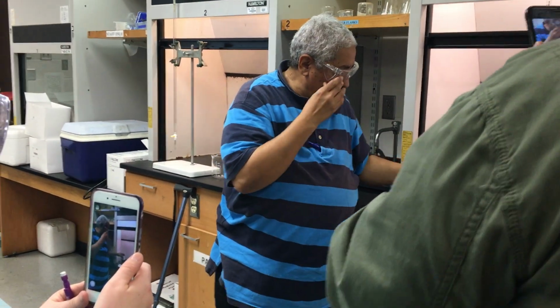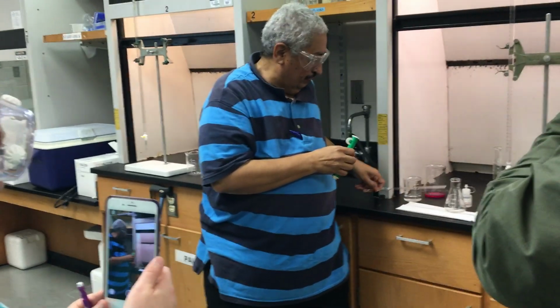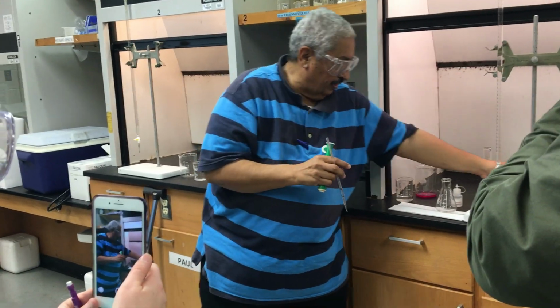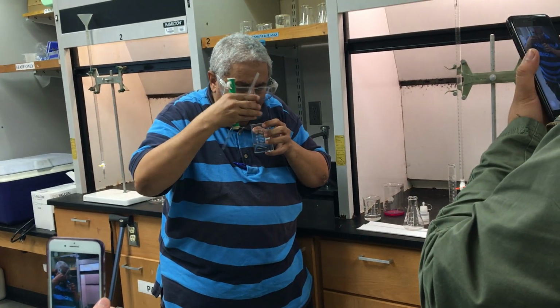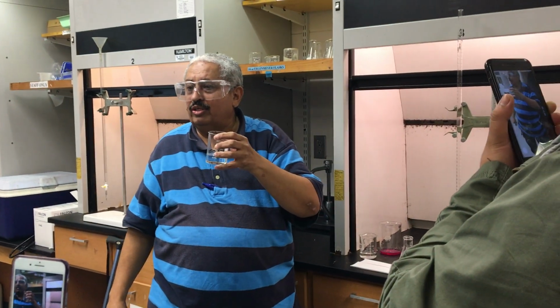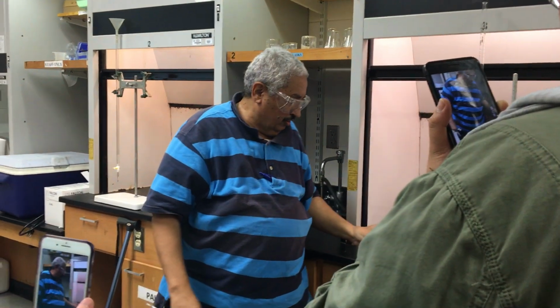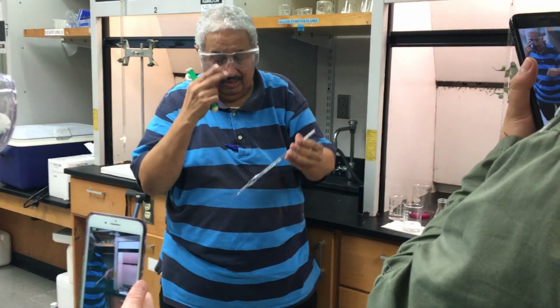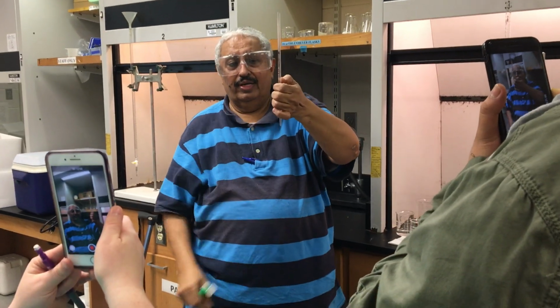3 drops, and now I have to pipette the vinegar here, which I think is vinegar. Waft a little bit, just to make sure that you don't mix the sodium hydroxide with the vinegar. It's really vinegar, you can smell it, verify it. So now I have to pipette 2 mL. The line of the 2 mL is here, correct?